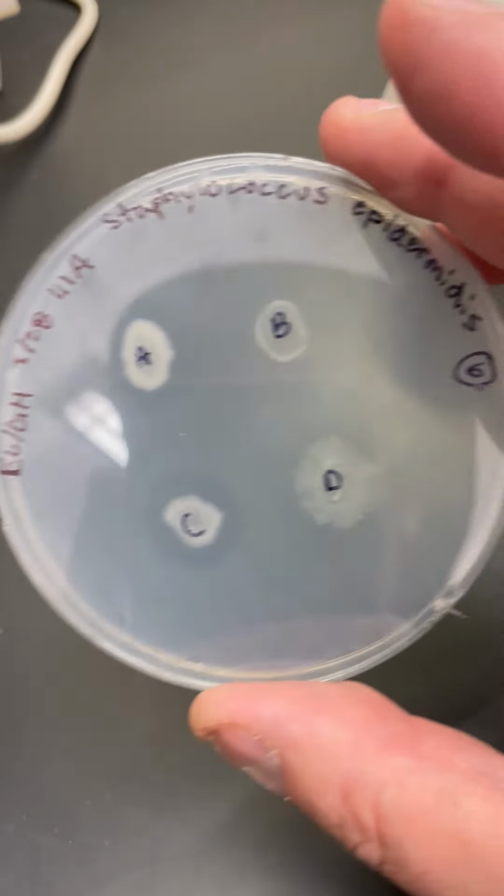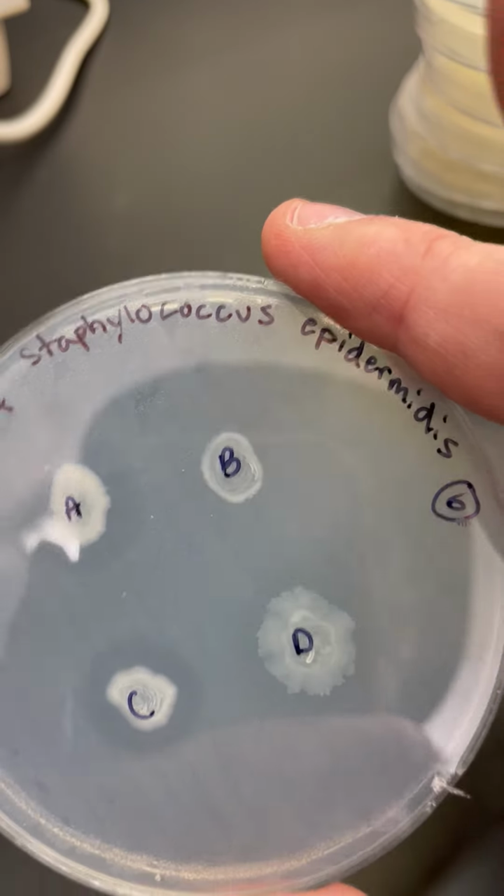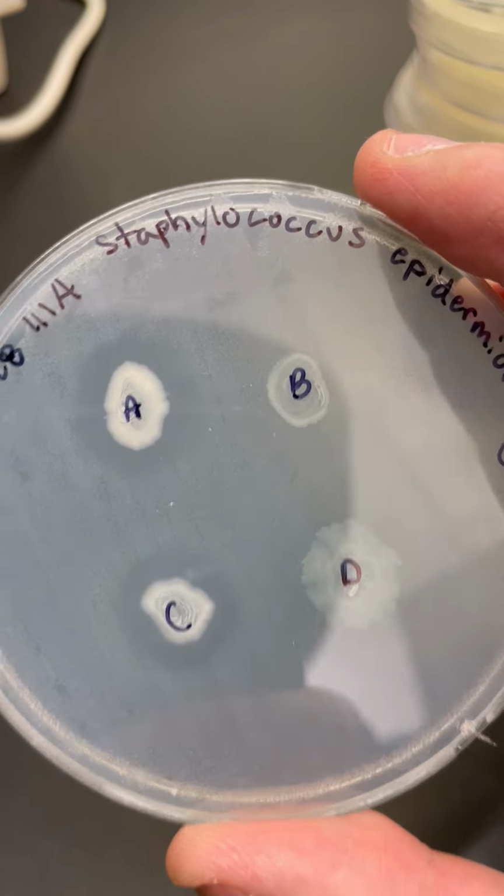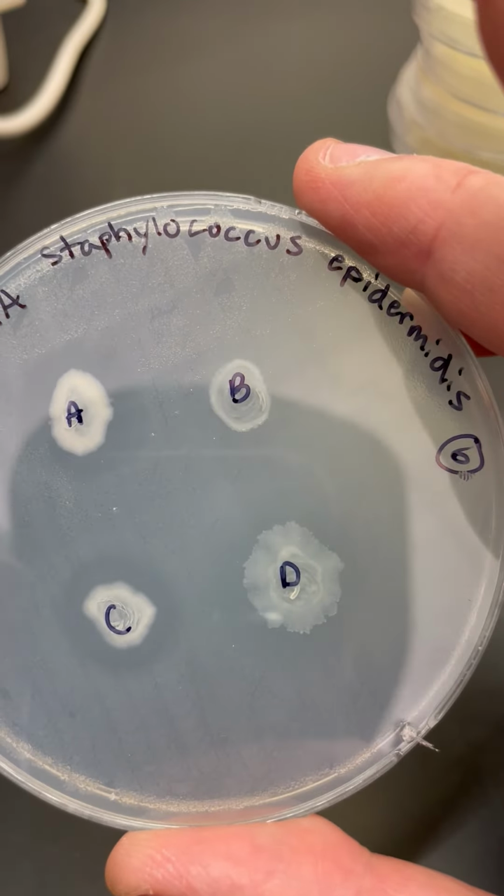After that is Acinetobacter, and when you look at that, maybe for C, but not so much. And then finally, Staphylococcus epidermidis. Now I have to tell you that for the Tuesday lab, we had some weird effects on that, and I'll talk about that in a moment. But here's how things look. I see a really clear zone of inhibition for A and for C, and maybe for D.